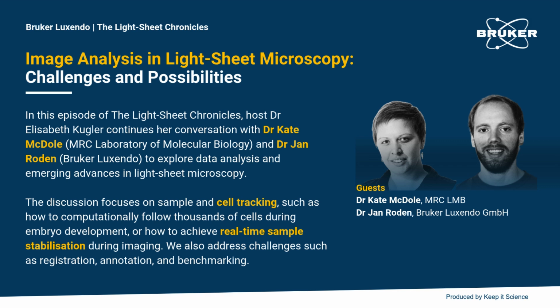Thank you so much for this wonderful insight, because I think it's very interesting that, for example, cell proximity can be an issue, but you're using neural networks, but also really the whole inter-sample similarity, like are the tracks similar, are they dissimilar? There's really this whole scale of data that you have to consider, which makes it super interesting from a data point of view, because obviously you need to zoom in, but then also zoom out a little bit. But I know, Jan, at Bruker you use a very different approach to sample tracking, because you don't actually look at single cells at the moment, but it's much more about tracking during the imaging, for example, where samples might drift or grow out during the imaging. Can you talk with us about why this is important and how you approach that?